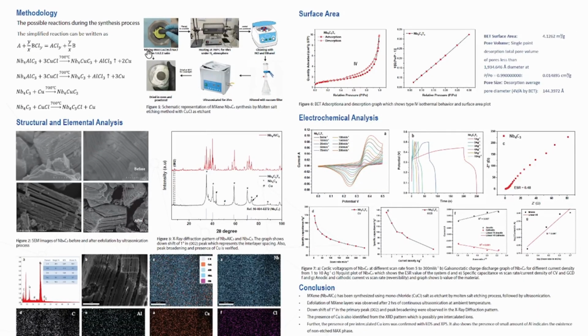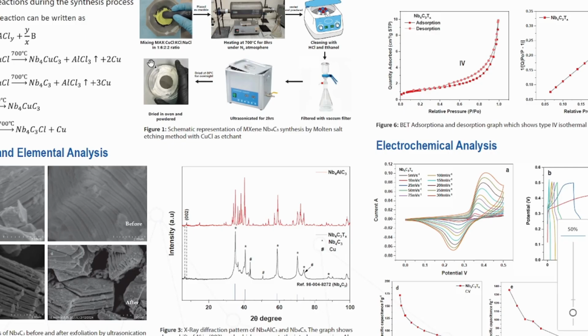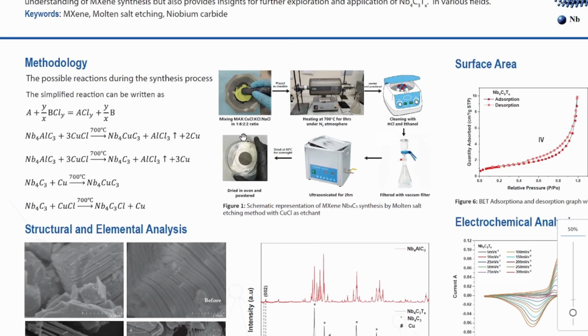So first of all, let us see the methodology. It involves mixing all the components in the ratio of 1:6:2:2. The MAX phase and the monochloride salt, CuCl, are mixed in 1:6 ratio, and the molten salts are mixed in 2:2 ratio. The mixture is placed in a crucible and heated at 700 degrees Celsius for 8 hours in a tubular furnace under nitrogen atmosphere so that the material won't oxidize.